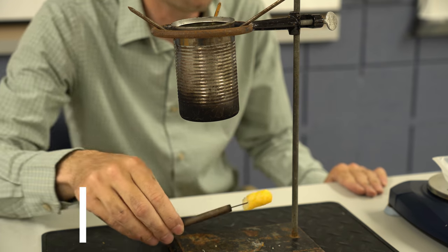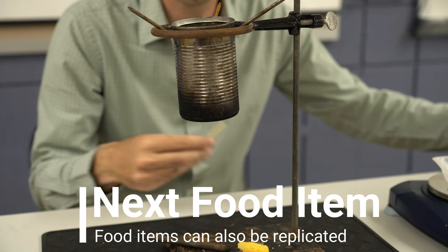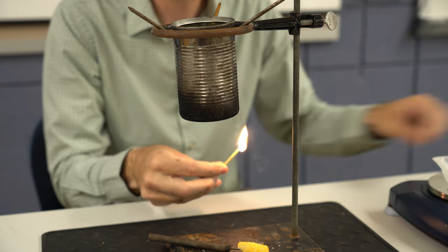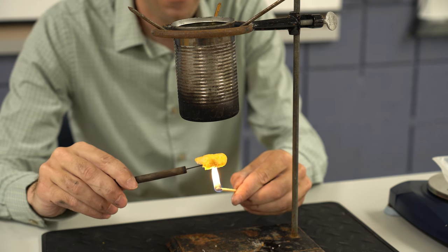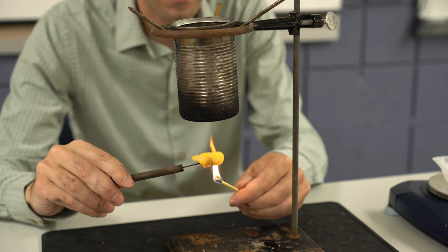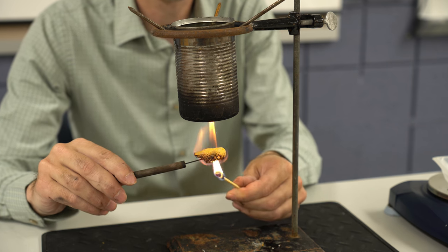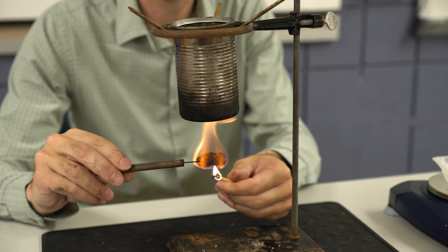Our next food item on the wooden skewer. I've got my matches ready to go. We're going to look at trying to time this as well. So I go through, I light my match. And remember, we want to keep it at that higher point in the match. That's where the flame is the hottest. Work it back and forth. We'll slowly rotate it.